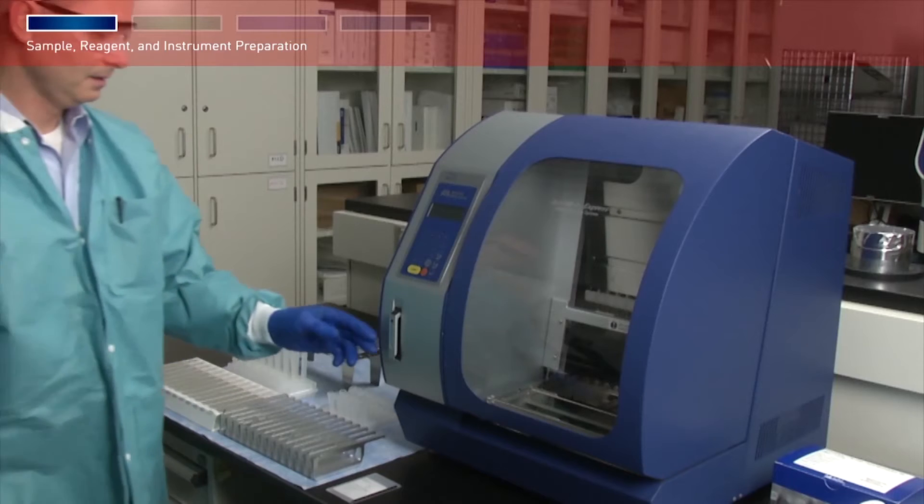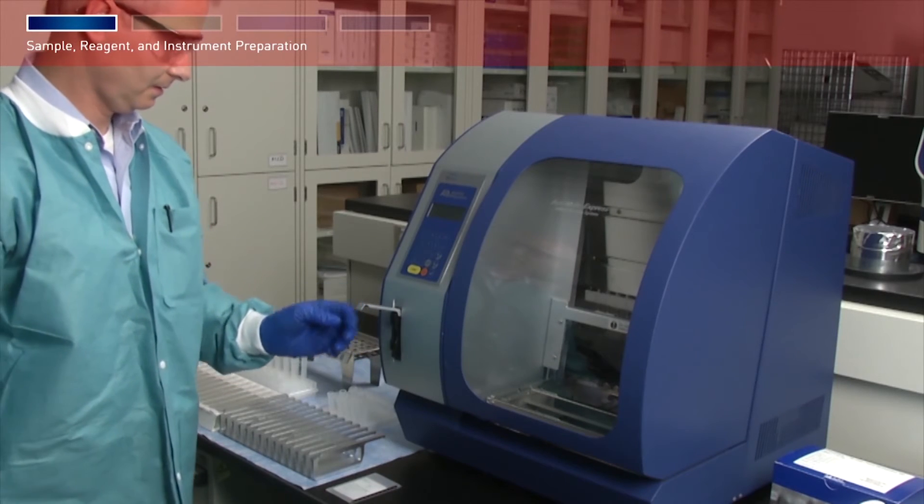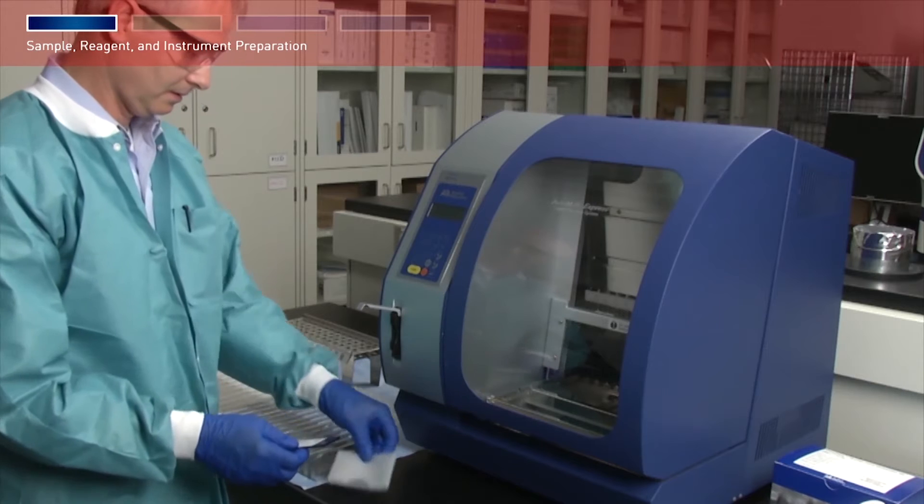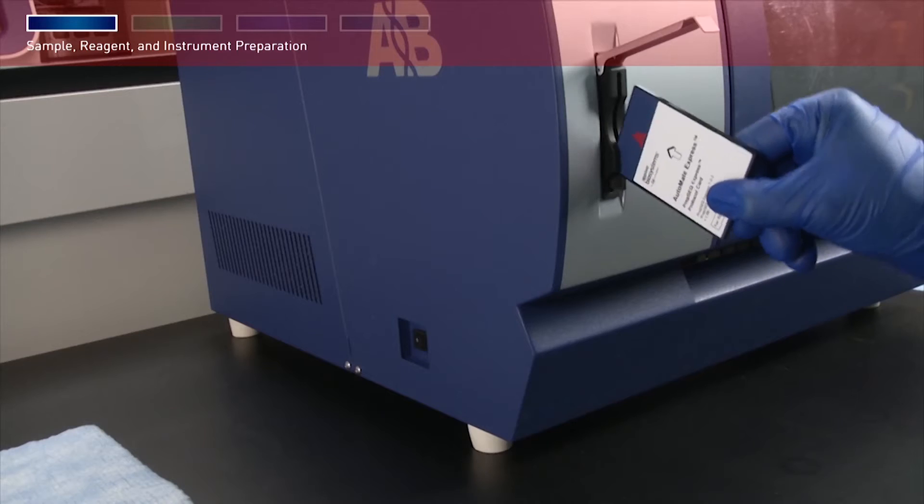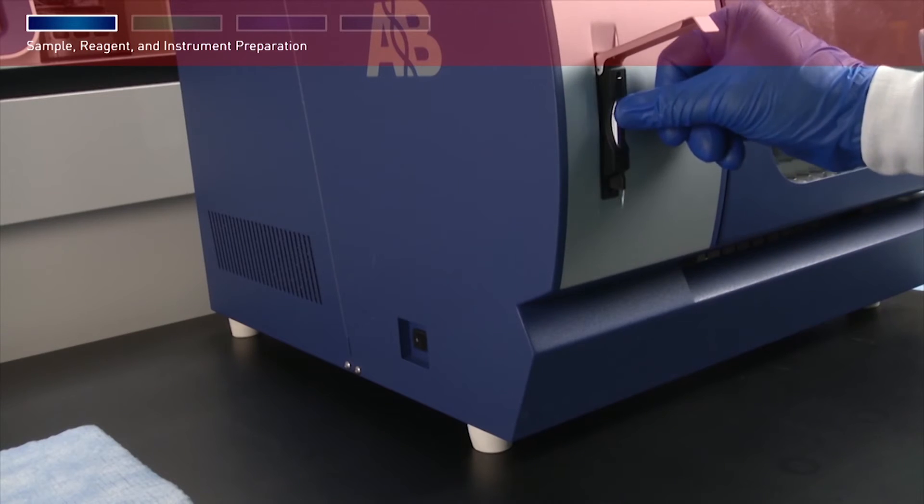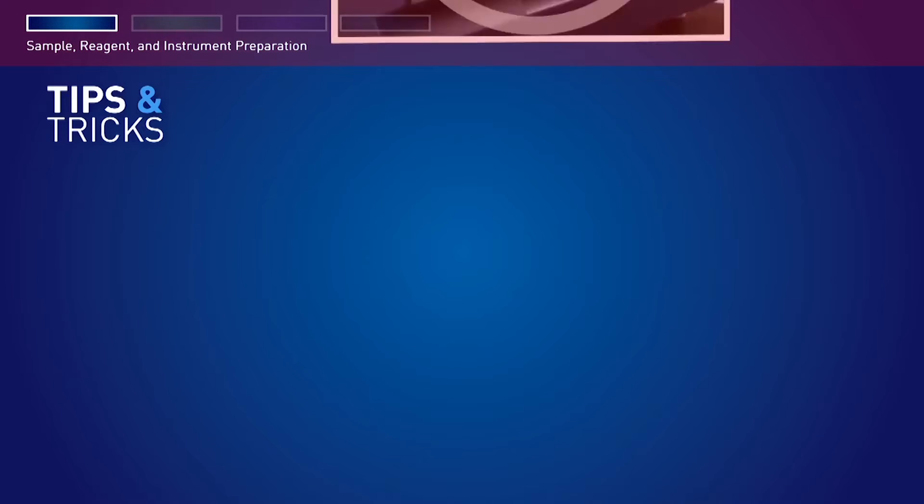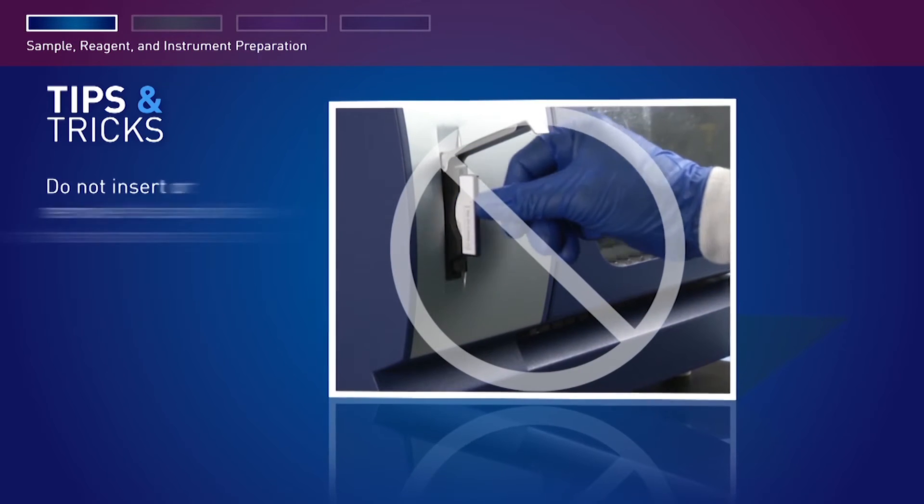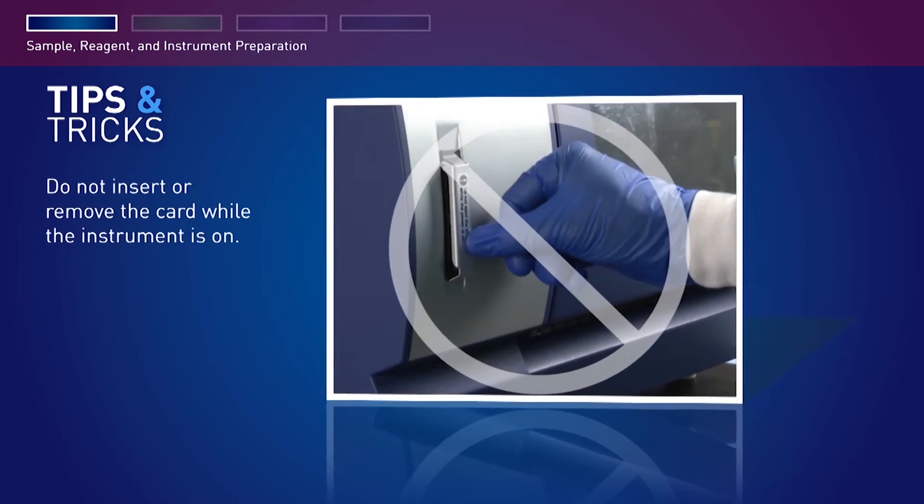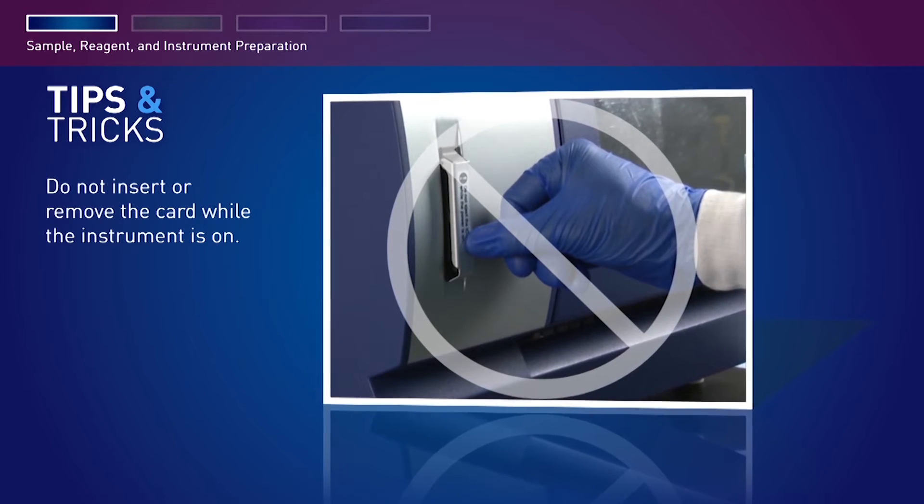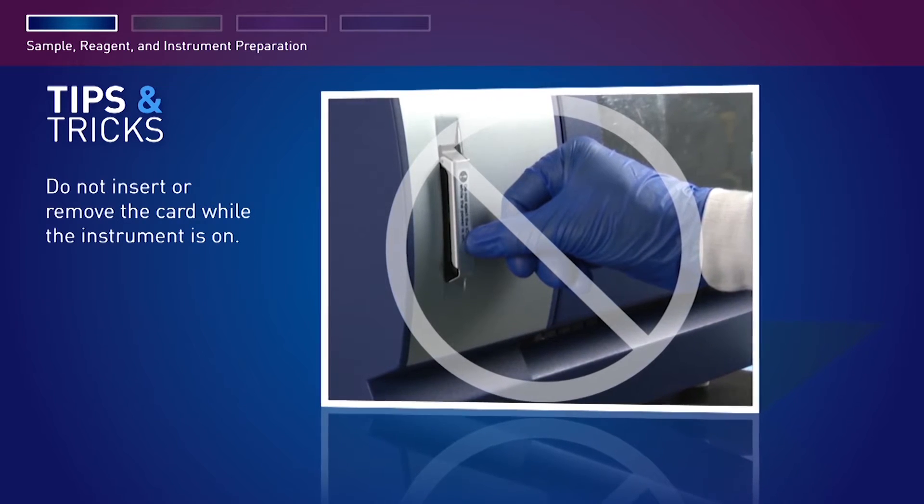Open the card slot and insert the PrepSeek Express kit protocol card in the slot with the arrow pointing toward the instrument and the card label facing left, then close the card slot. Do not remove or insert the protocol card while the instrument is on. Removing the card stops the run and may cause instrument data file loss.